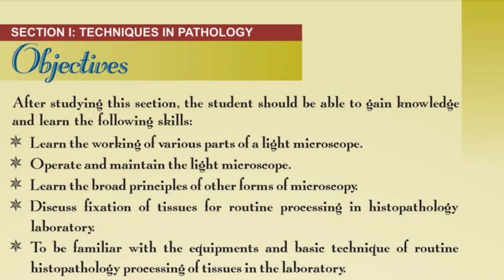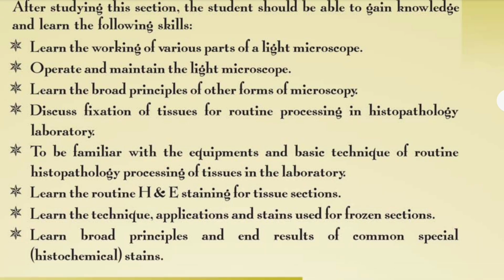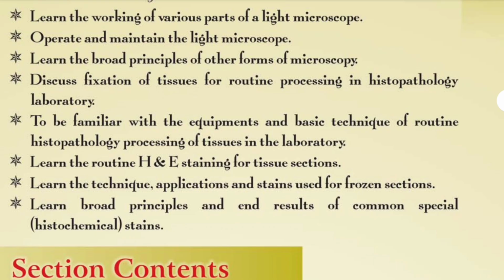तो सेक्शन 1 टेक्निक्स इन पैथोलॉजी, आज हम लोग देखेंगे क्या ऑब्जेक्टिव्स। आफ्टर स्टडिंग दिस सेक्शन द स्टूडेंट शुड बी एबल टू गेन knowledge and learn the following skills: learn the working of various parts of a light microscope, operate and maintain the light microscope, learn the broad principle of other form of microscope, discuss fixation of tissue for routine processing in histopathology laboratory.